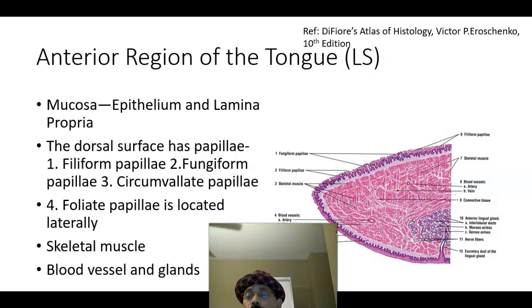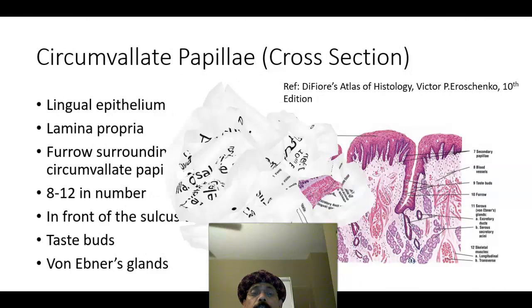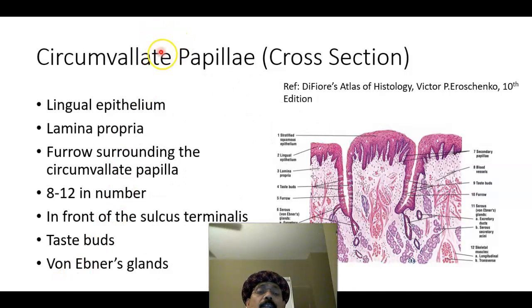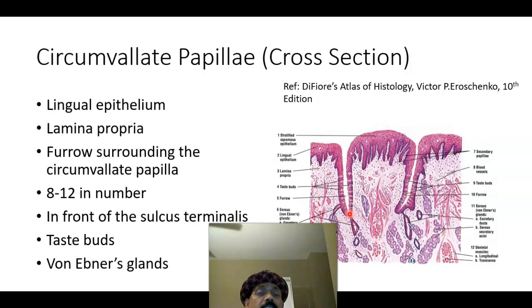The excretory duct opens to the ventral surface of the tongue. The circumvallate papillae are very important — they are present in front of the sulcus terminalis, nearly 8 to 12 in number. These are the largest papillae and are always distinctly visible.